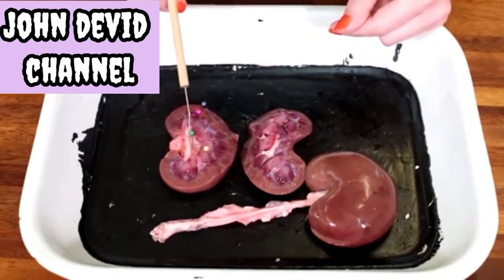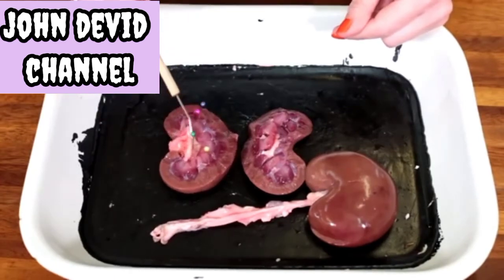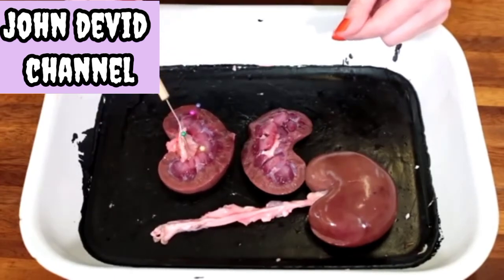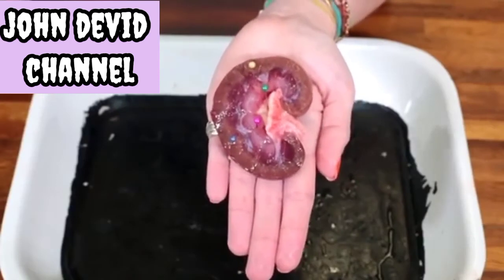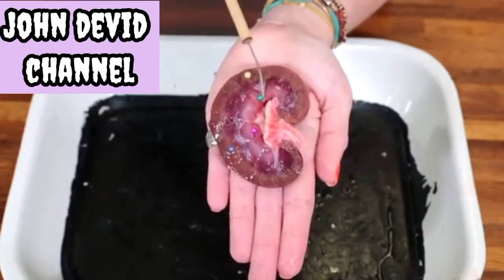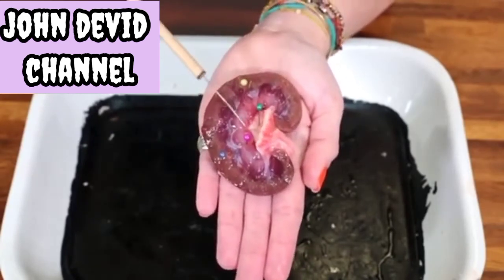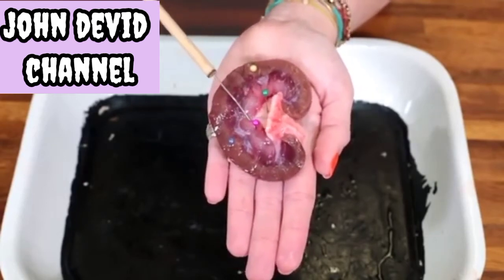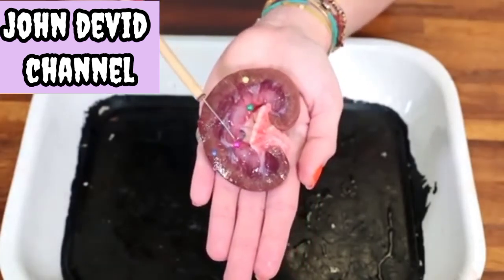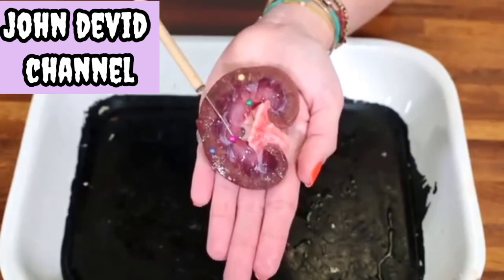Feeding into the centre area we have what we call the pelvis, marked by the green pin. It's the pelvis that feeds into the ureter, which we cut off earlier in the dissection, and transports excretory products out of the kidney towards the bladder. The pelvis is a hollow structure, and extending from here are collecting ducts which go into the medulla. If you prise back the soft tissue of the medulla slightly, you can see the tubules.